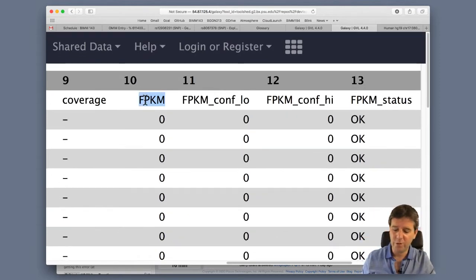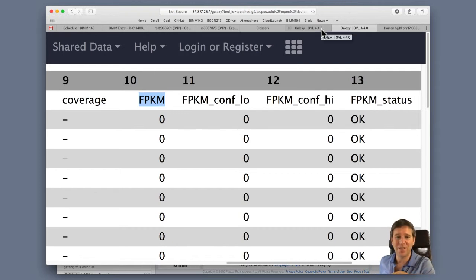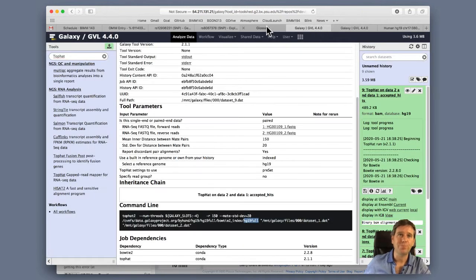So we've done the hard work, okay? So you're very welcome to play with the Galaxy server. You'll have access to it for a little while, and try different mapping methods with this data. You can explore those, or just follow along with our instructions here. What we would do in our next section, obviously, is we've got it for one individual.